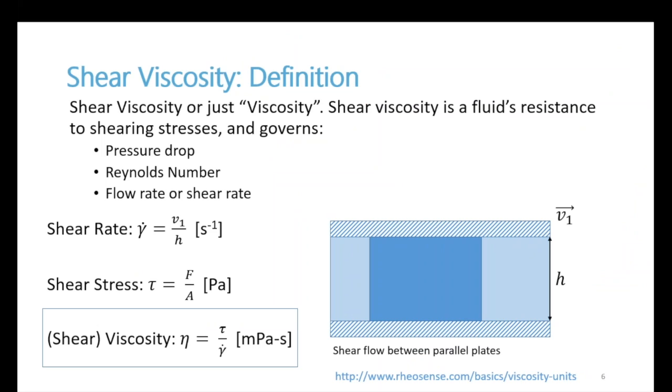So as you could imagine from what I just said, shear viscosity is the resistance of a fluid to shear flow or shear stresses.